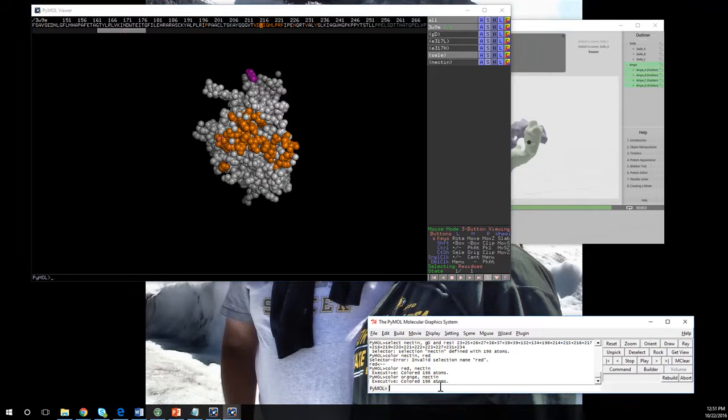And if I don't want that selection in there anymore, I can type in delete down here at the bottom, and I'll do this quite frequently because I don't really like that in there. So now that's not in there anymore. Up here, that selection is gone. So that's how you can kind of get an idea of where everything's at.